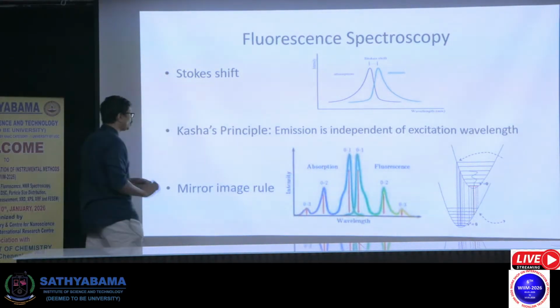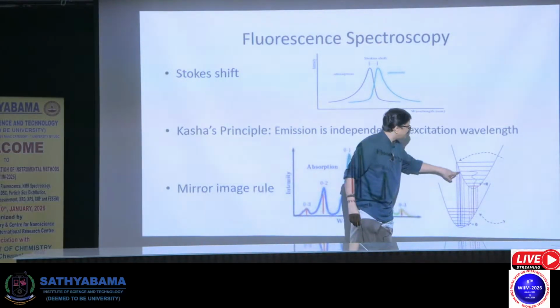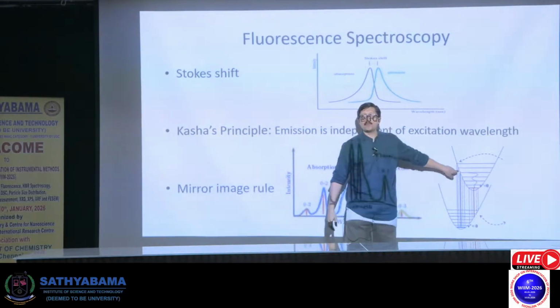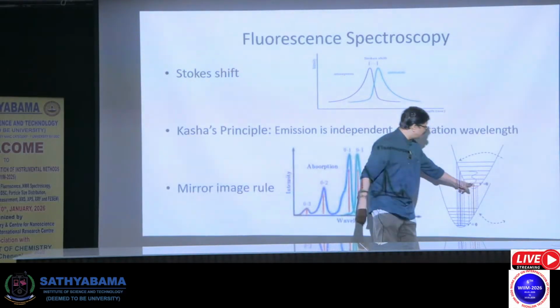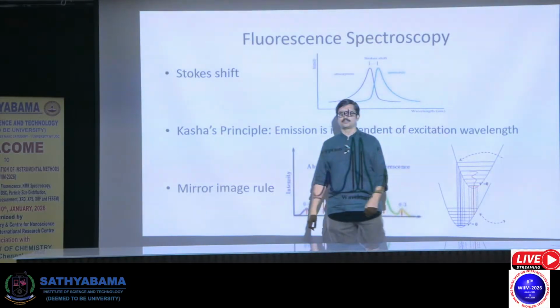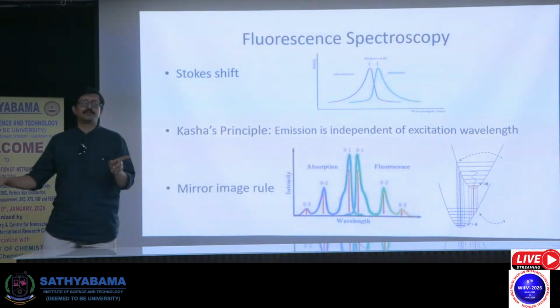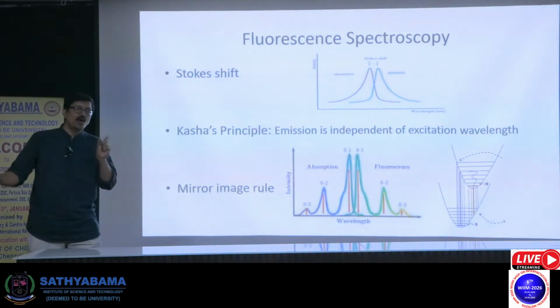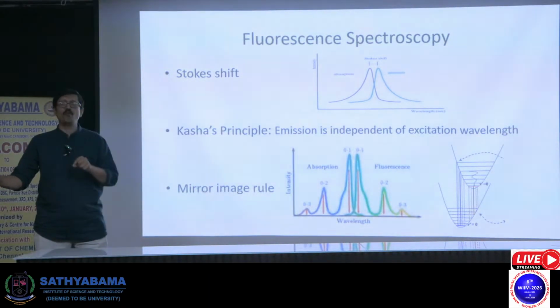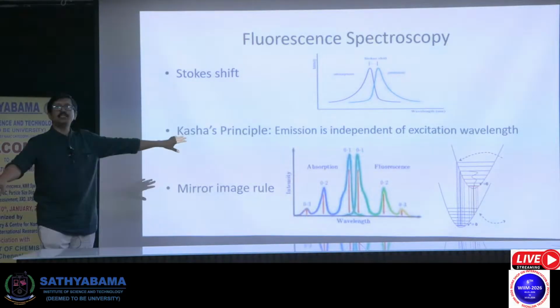So there is a 0 to 3 absorption, and 0 to 3 emission. If you calculate the probability of that absorption, it will be equal to the 0 to 3 emission. So there is a one-to-one probability correspondence between absorption and emission in an electronic excitation due to the involvement of vibrational levels. That's why there is a mirror image principle. Next, sir.